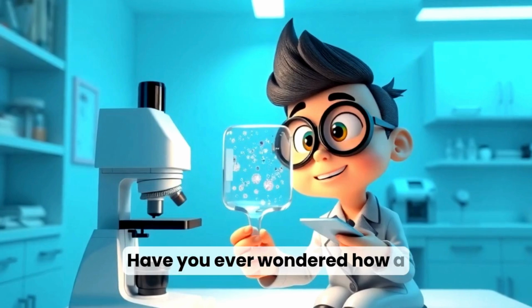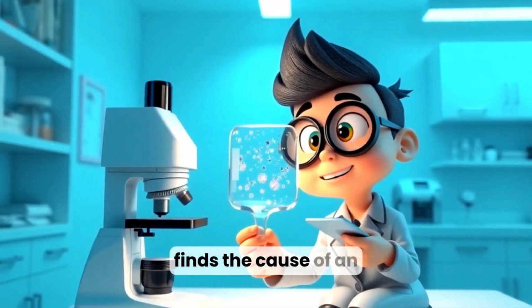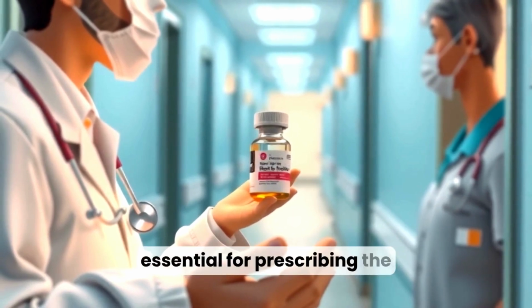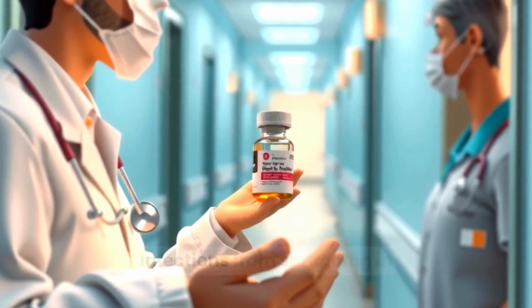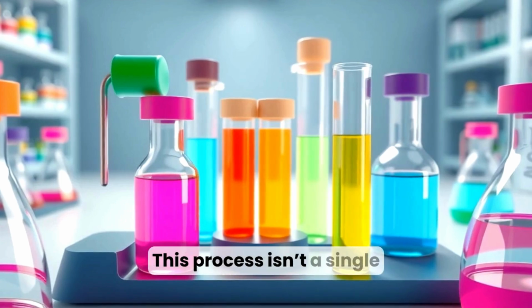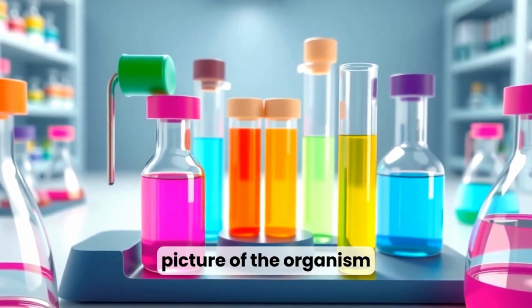Have you ever wondered how a microbiologist identifies an unknown bacterial sample and finds the cause of an infection? Identifying bacteria is essential for prescribing the right antibiotics and stopping infections from spreading in hospitals and communities. This process isn't a single test, but a series of methods that together build a clear picture of the organism.